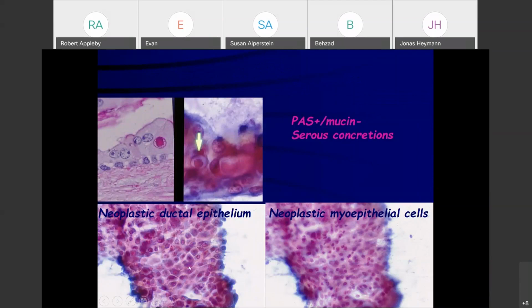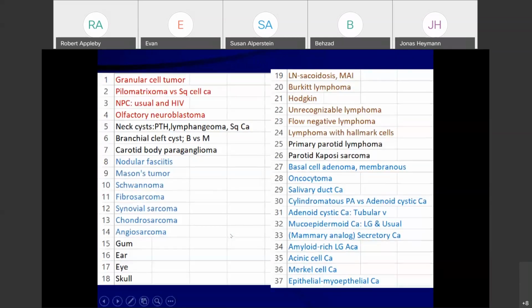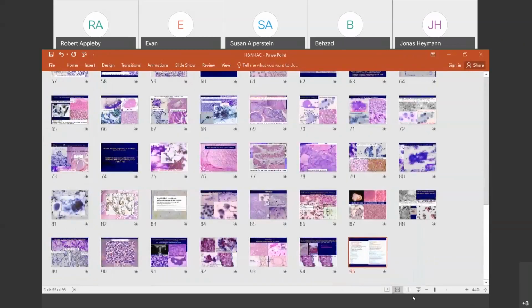And then I went back to cytology. I said, what are the large epithelial cells? And by focusing on a different focal plane, I saw large epithelial cells. Another case. So here is the final summary of what I just showed you. It's my personal approach and my experience. Whatever you decide will be fine.